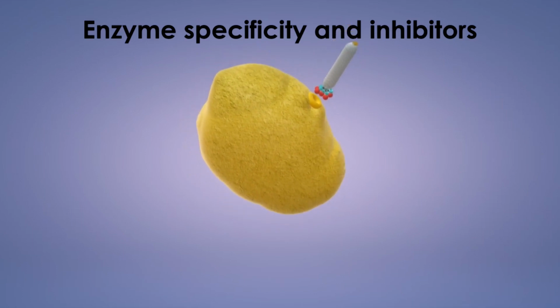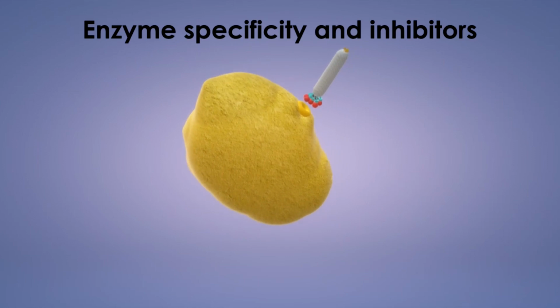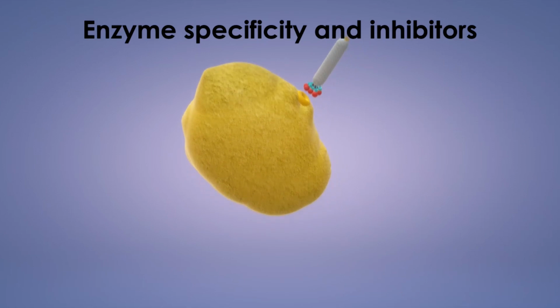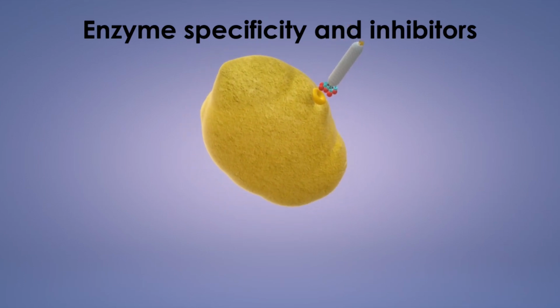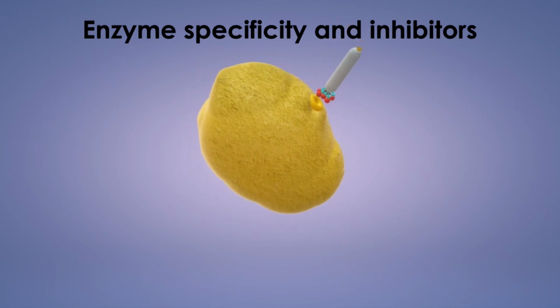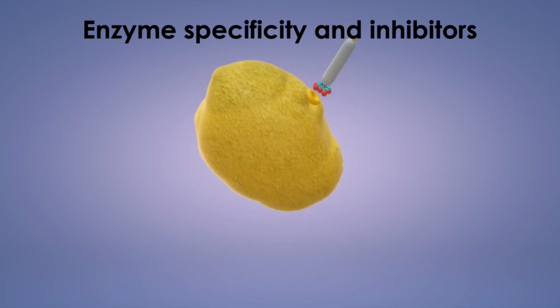In this case, the enzyme will act as the selector, as explained before, and the random peptide bound to the phage is the one that is going to either activate or inactivate it. In the second example, we can see that we can inhibit protease activity in an enzyme thanks to phage display. But how? Well, we can seek the peptide that will bind to the protease site thanks to phage display. After finding it, we will amplify that selected phage, and then we will add the peptides to the enzyme. They will join the protease site, impeding the protease activity, and then obviously making them resistant to cleavage.